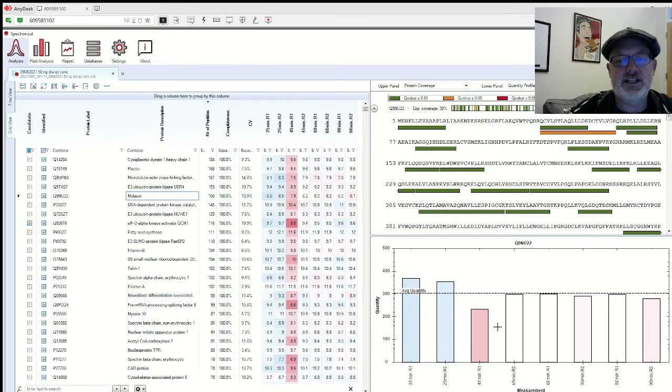This is interesting. One of these 45-minute runs didn't work very well. And then you can see that this seems to be less expressed in the longer runs. Why is that? Well, that's interesting. It's probably because the peaks are higher. I don't know exactly. That's my theory anyway, but they should be the same.